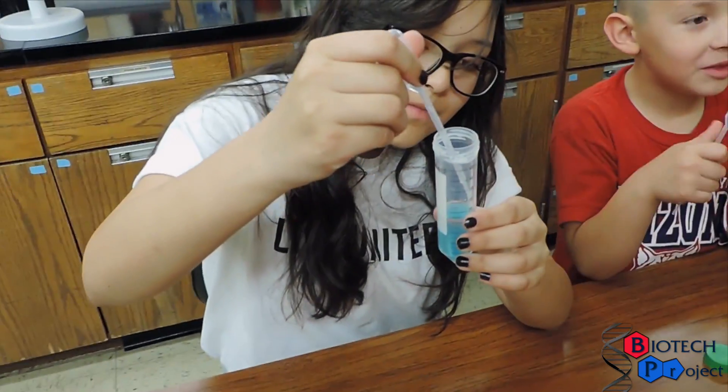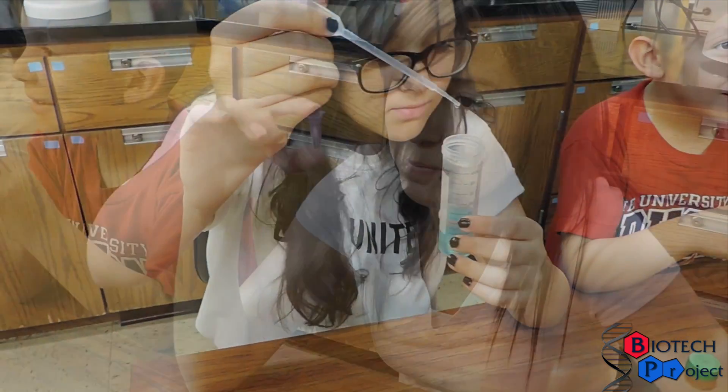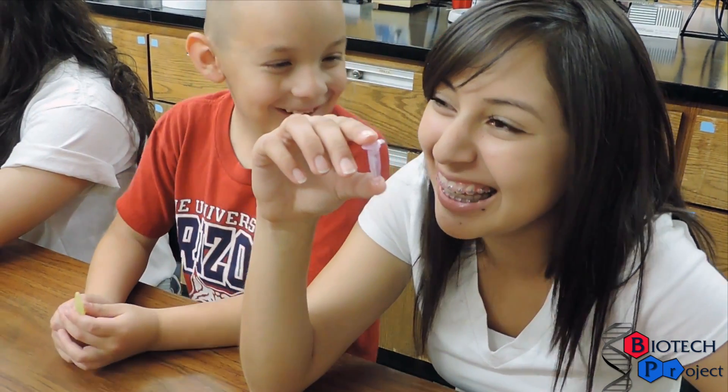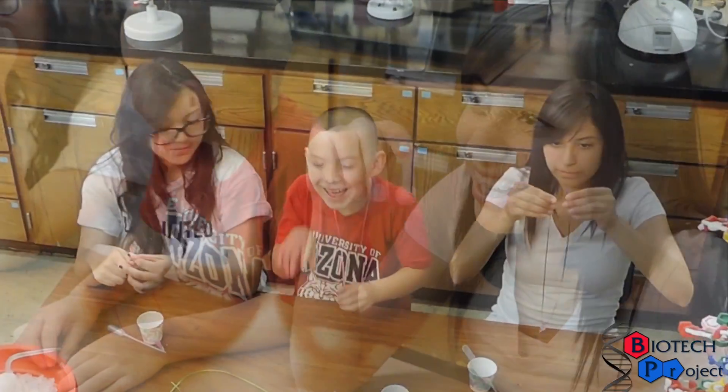To remove your DNA sample, carefully pipette the stringy layer between the top ethanol and bottom detergent layer into a small tube with ethanol for long-term storage. Feel free to place the small tube onto your favorite color of string and keep it as a necklace. We hope you had fun learning about DNA today!